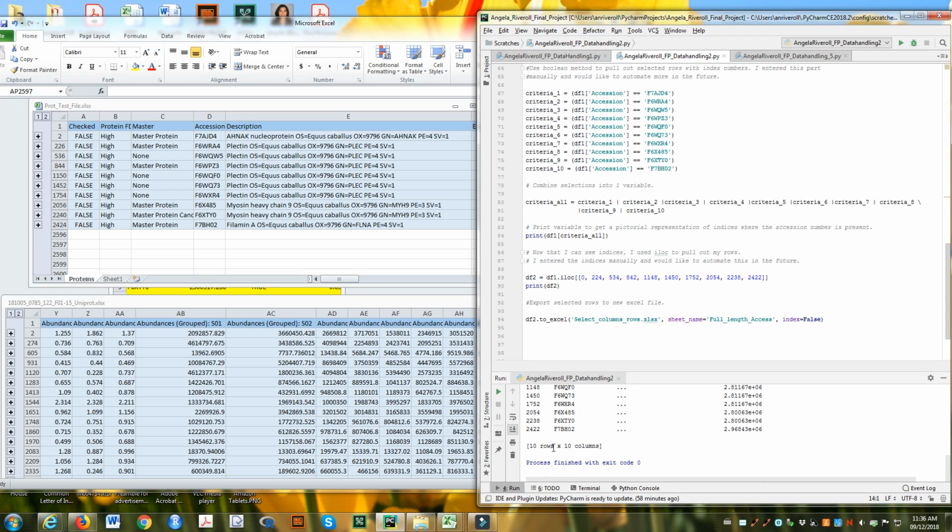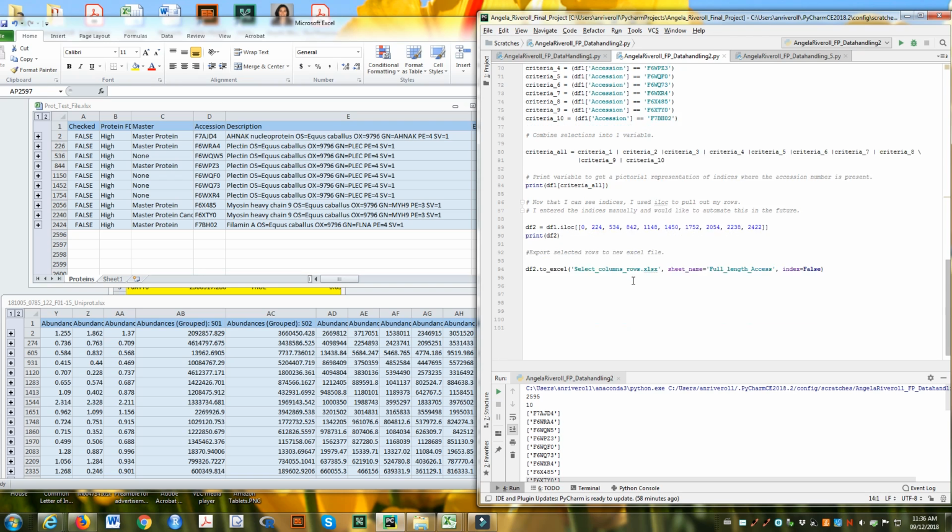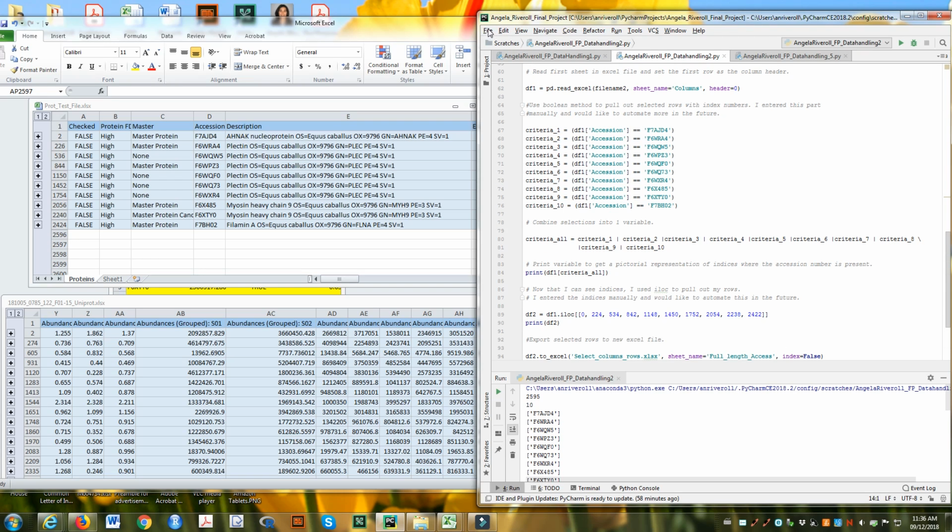So you could see that I had now a 10 by 10 instead of a 2595 by 10. Then I moved on from there to my next script.